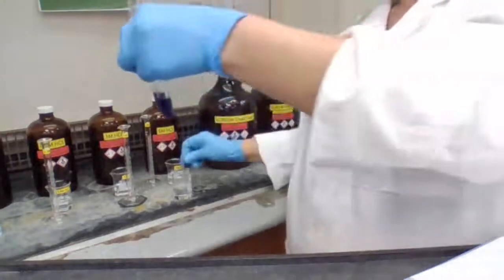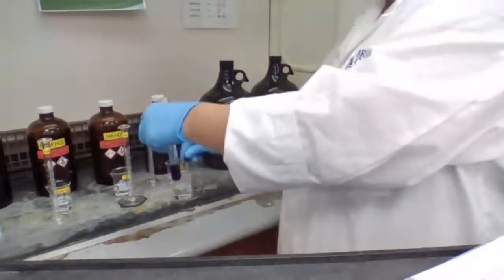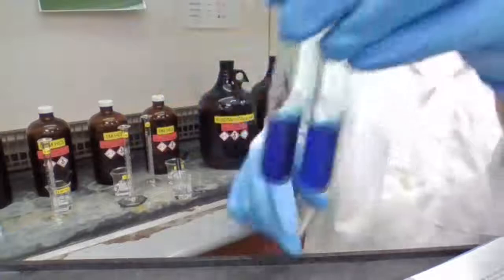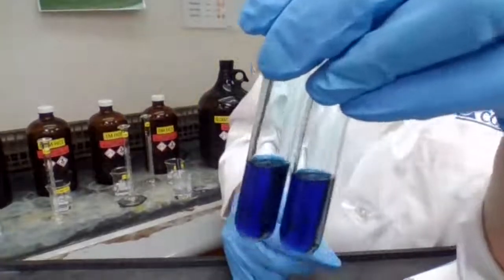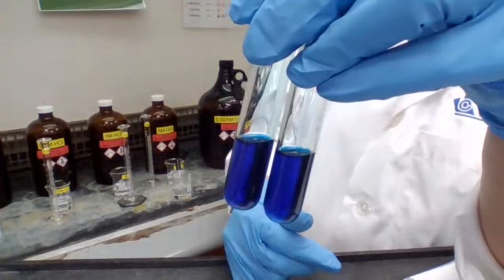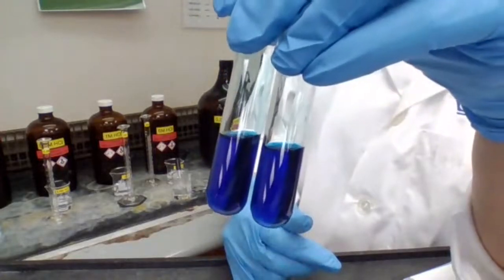Record your observation after adding HCl to both test tubes.